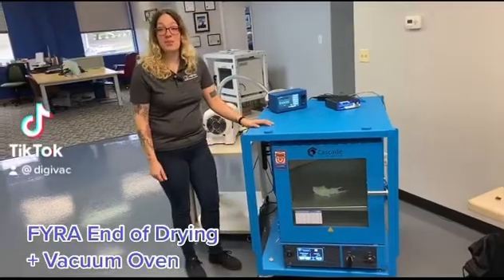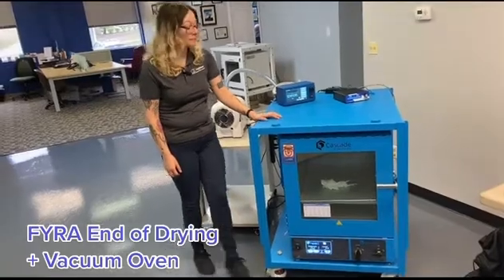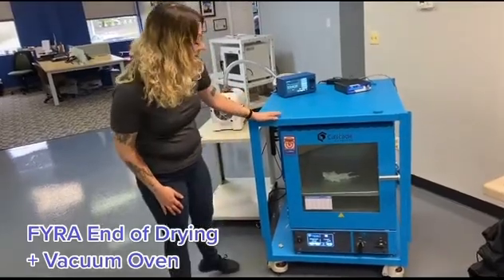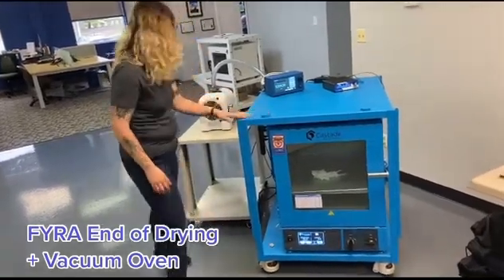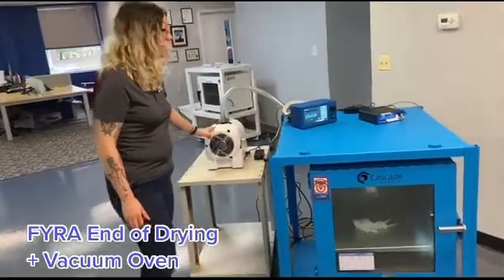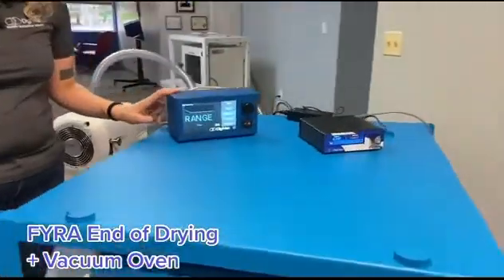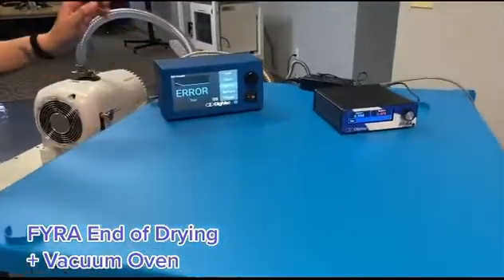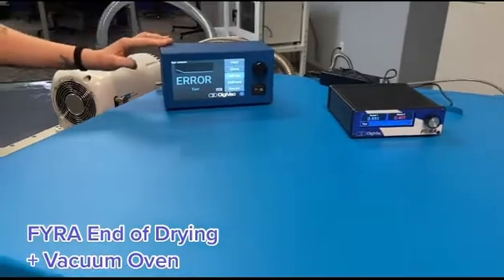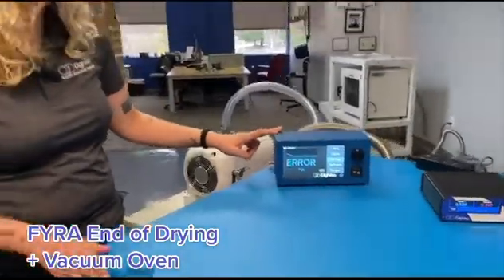Today we're demonstrating an end-of-drying process used to remove the solvent heptane from a cannabis isolate. Here we have a Cascade Sciences vacuum oven, the Agilent IDP10 which is the pump we're using to pull a vacuum on the system, and our SNAP vacuum controller which uses a proportional valve to restrict or increase the orifice size to allow the pump to pull either less or more vacuum on the system.